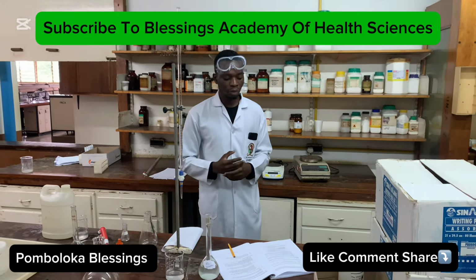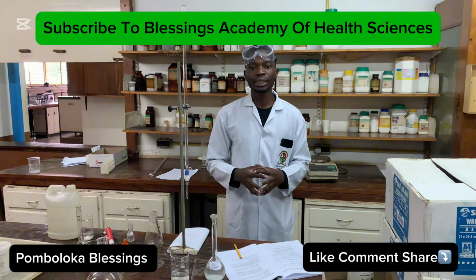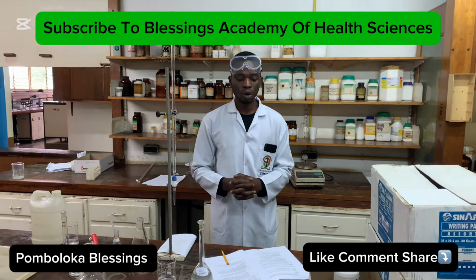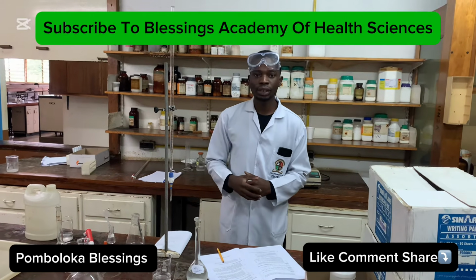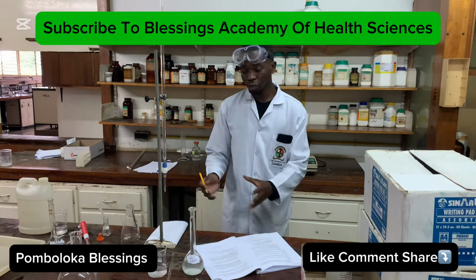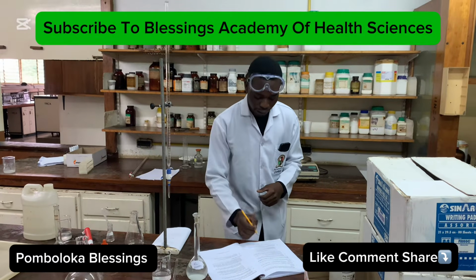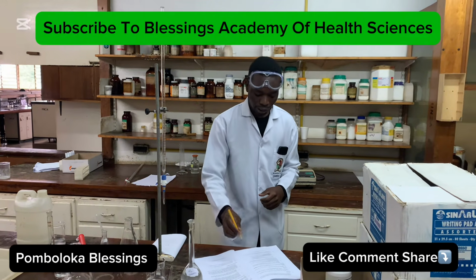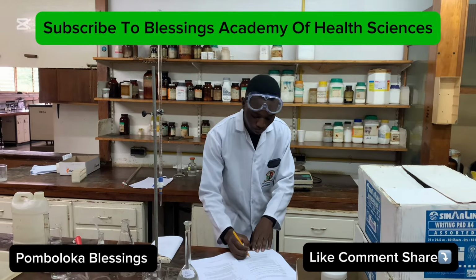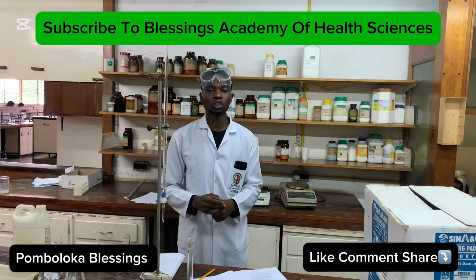From there, how many values do we have? We have 3 values, and then we're going to find the average of those values. When we find the average of those values, we call that the mean titer volume. So from the titration that we conducted, the first part, the second part, and the third part, I have found my mean titer volume as 16.8. After finding your mean titer volume of 16.8, this becomes the volume of the sodium hydroxide.